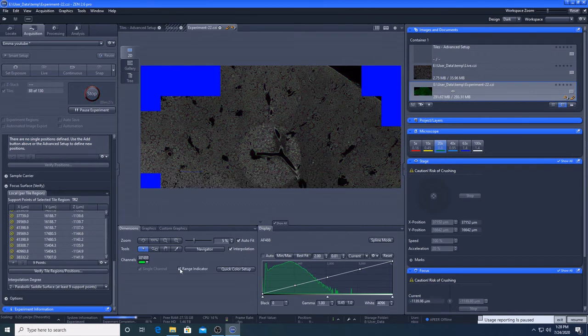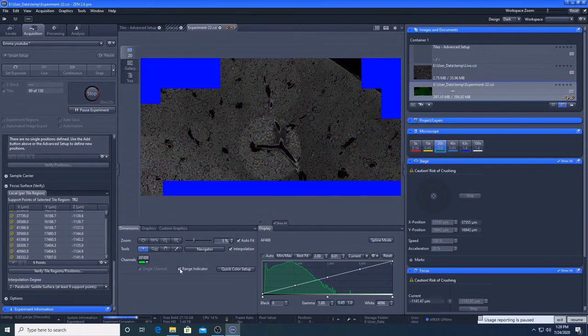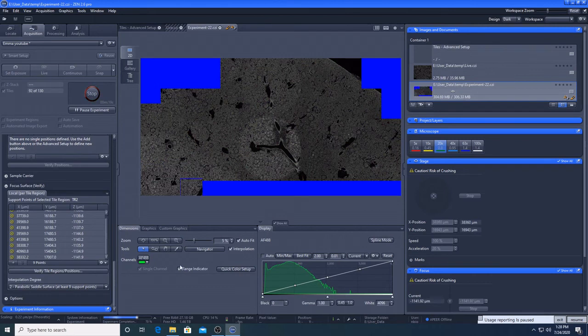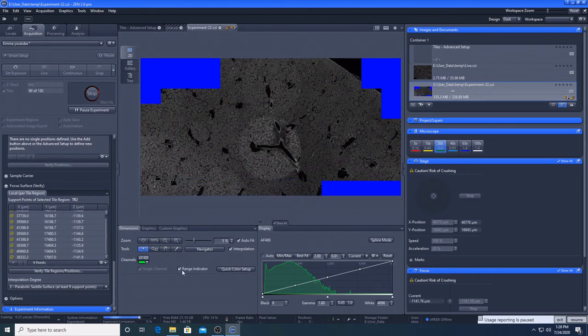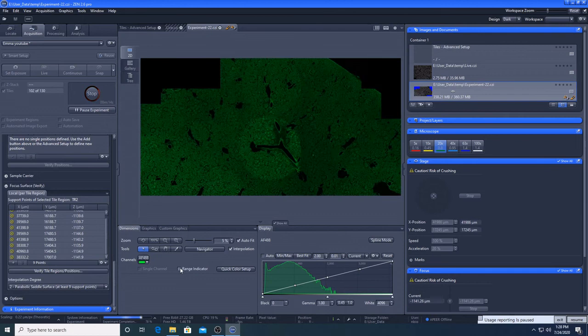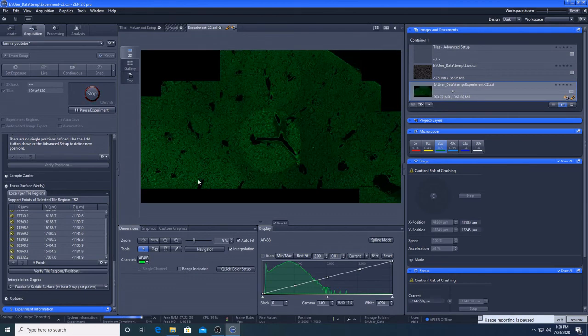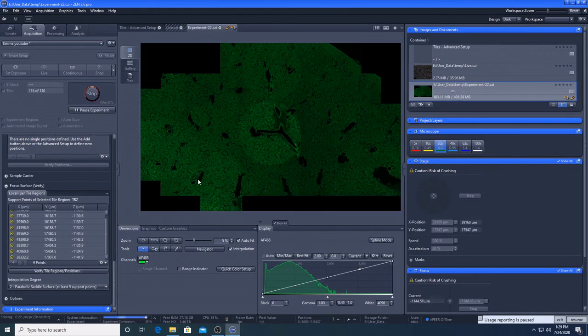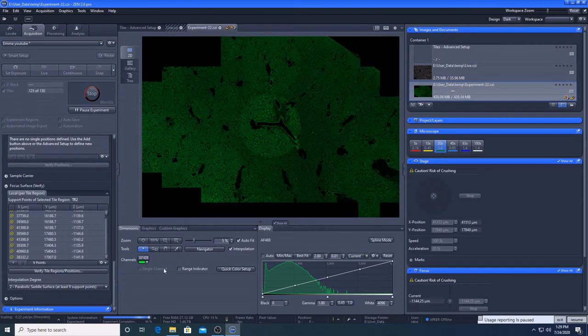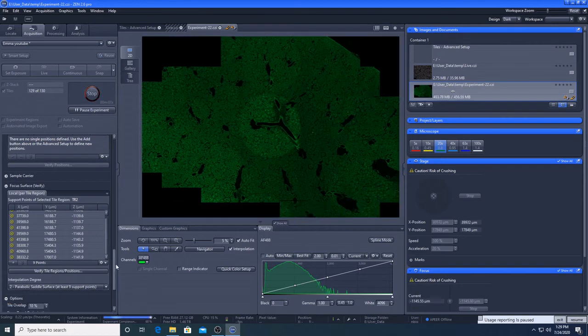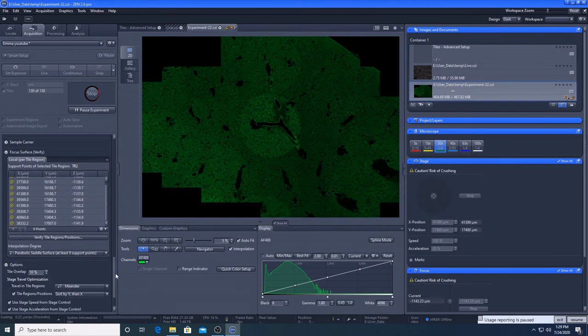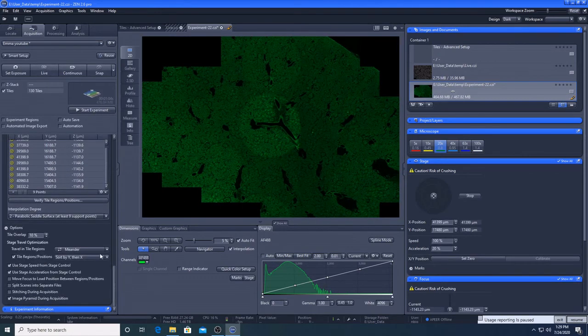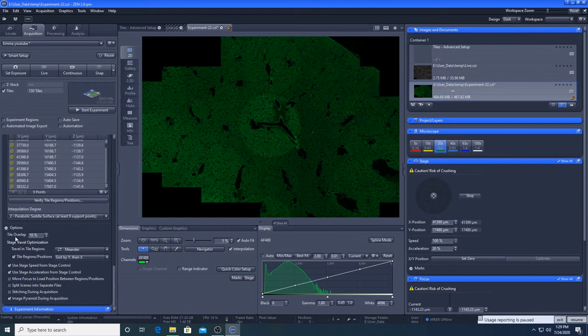Check whether it's overexposed. We'll move it to the edge. That's just where we've not taken an image. So we have additional options down here, so the default is for the tile overlap to be 10% and that's usually fine. You don't usually need to do anything about it. If you had any difficulties with getting the overlap then you could perhaps extend it, make the overlap percentage higher.